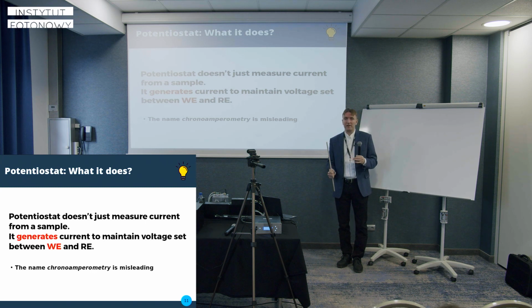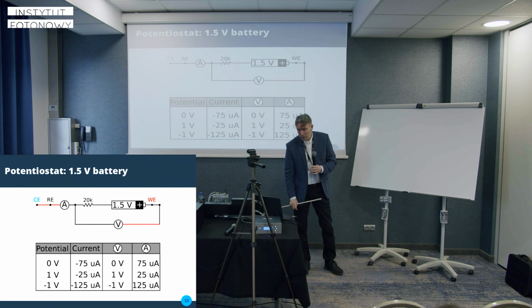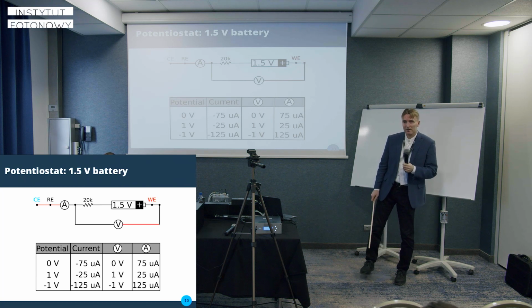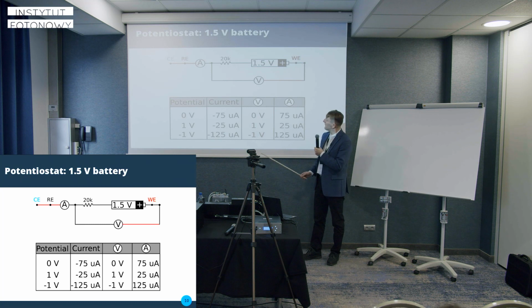So you need to consider that the potentiostat can harm your samples. I will show now on the same example how not to use it.